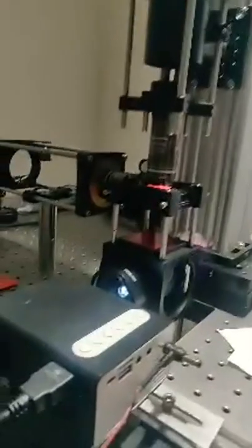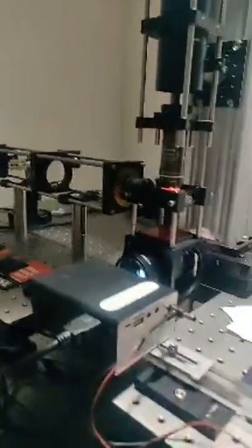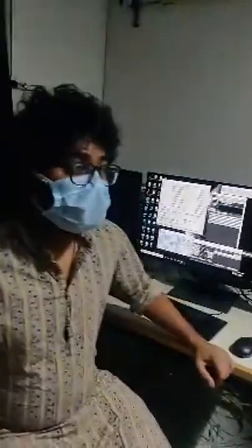So this is a light sheet microscope that Sriram in the lab and I built, and this is what we use for our experiments. Can you tell us a little about it? Sure. Guide us through it.